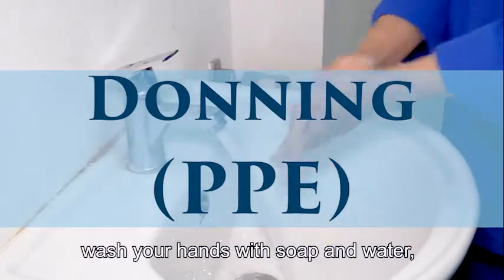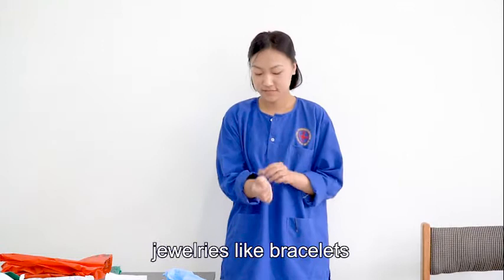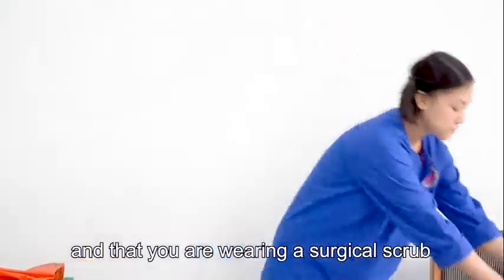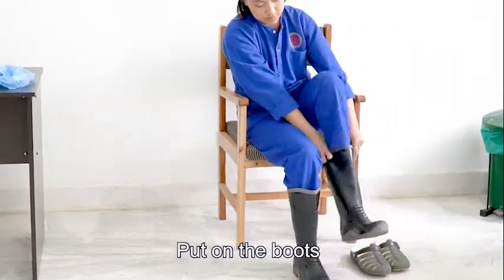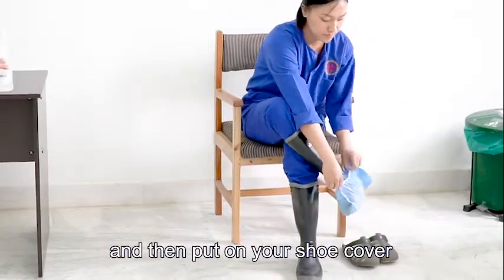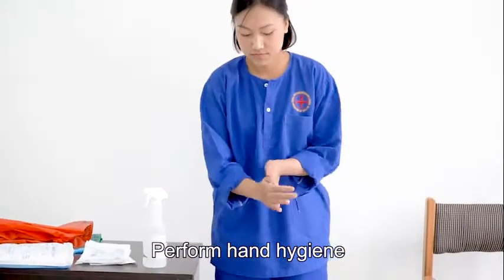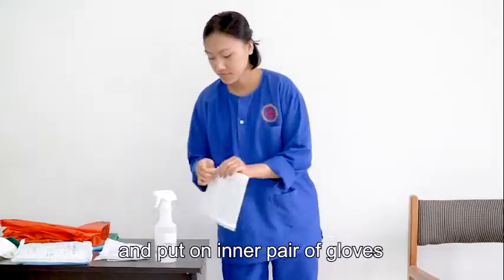To begin with, wash your hands with soap and water and remove watches and other non-smooth jewelries like bracelets. Make sure your street clothes are removed and that you are wearing a surgical scrub. Put on the boots and then put on your shoe cover. Perform hand hygiene. And put on inner pair of gloves.